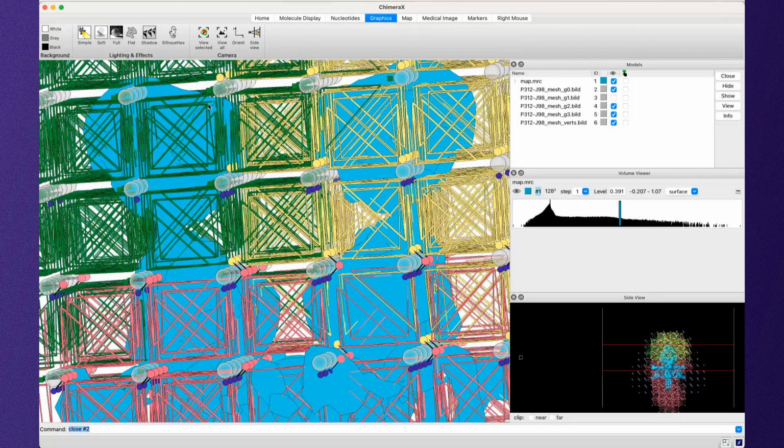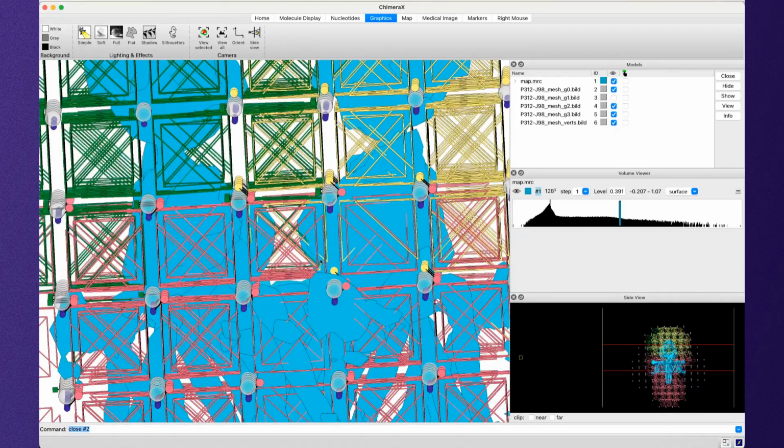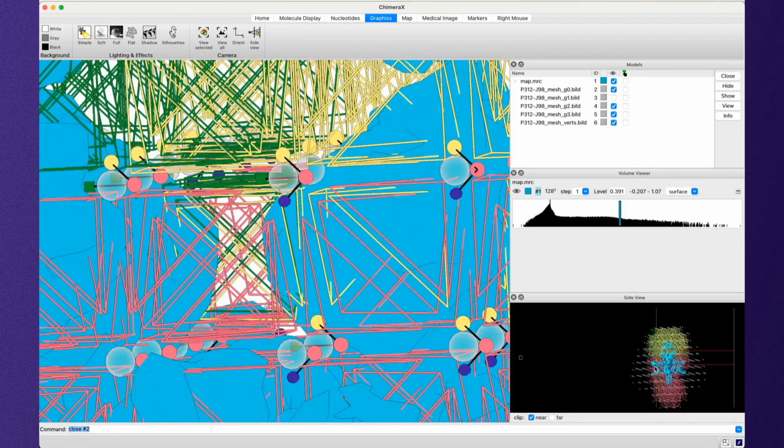And the green mesh can take its copy of this vertex left to match the deformation we see here. And that will also bring with it all of these tetrahedra. That's why they overlap. Each of our meshes has a separate copy of this region of the map that it's allowed to deform. But now, if we look down here, this part of the map was probably within our fab segment. However, if we look closely, it is all fused to the pink segment.